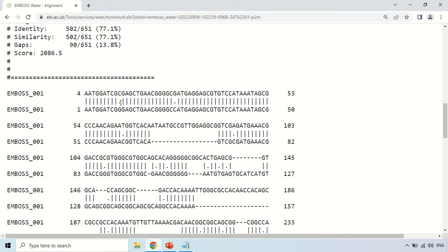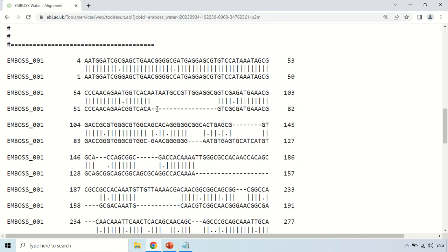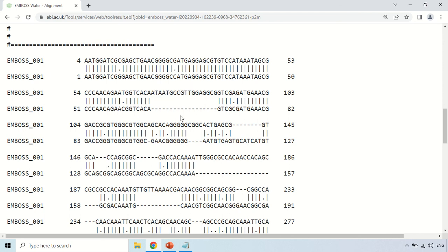The mismatch is represented by a dot. These dashes represent that no corresponding nucleotide was found for those positions in the first sequence — there is no sequence corresponding to those bases, so they are represented by dashes. To summarize: a vertical line means a similar base or nucleotide, a dot means a mismatch, and dashes mean no corresponding base is present.